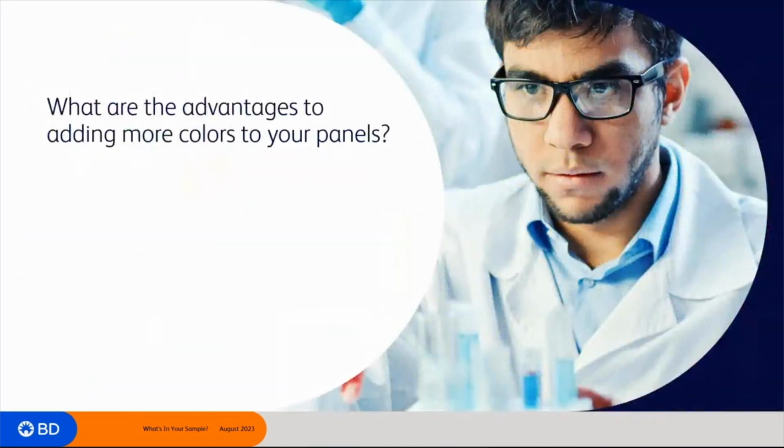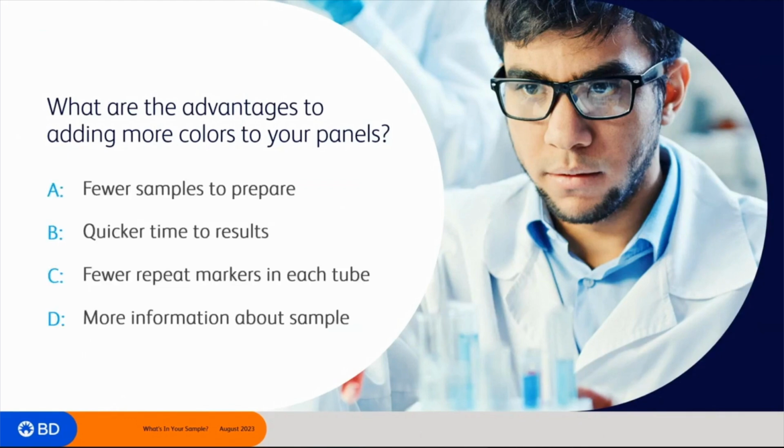So think about what panel you are using in the lab, whether they have 6, 8, or 10 colors. Have you thought about adding more color to your panels? And in doing so, what are the advantages? So it could be fewer samples to prepare, which is important when you have a limited amount of sample. Oftentimes in the lab, you need to split a hard to collect sample for many ancillary tests. By the time it gets to flow cytometry in your lab, there is a tiny portion, and you need to make use of what you have.